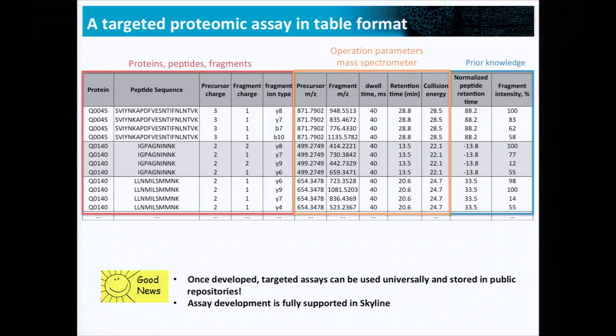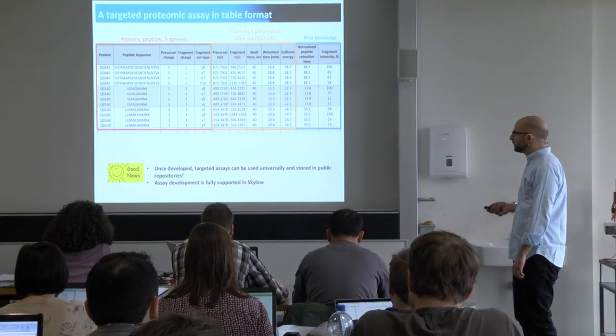We said in the last talk that the bad thing is that it may take a lot of time to get to the table, unless you can download it from somewhere or somebody already made it for you. But once it's developed, you can always use it again, and then measurements can take some speed.